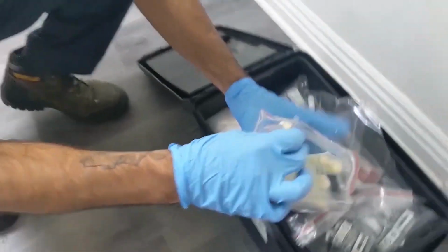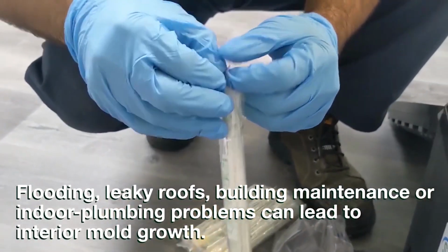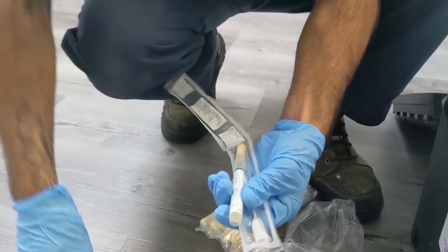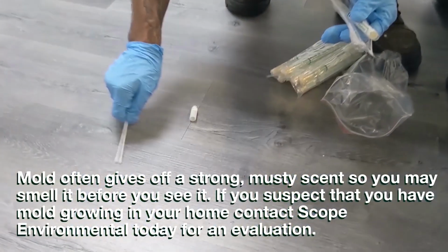These are cotton swab samples. So this itself is for direct samples only. Very similar to a Q-tip. This is the capsule. We'll go ahead and open that up. You're definitely not supposed to touch the Q-tip area. And with this itself, just an example, test the area itself. So it's a direct sample.